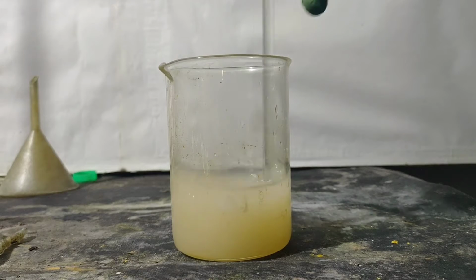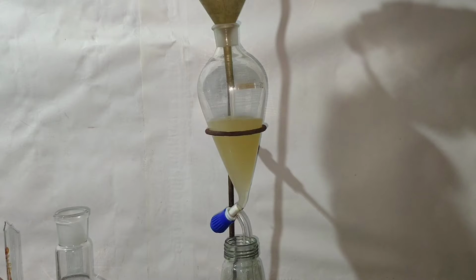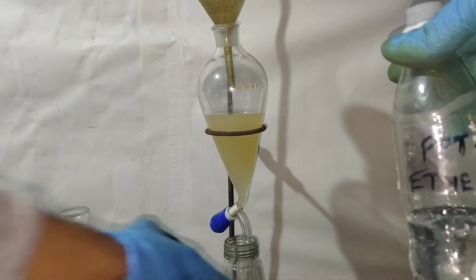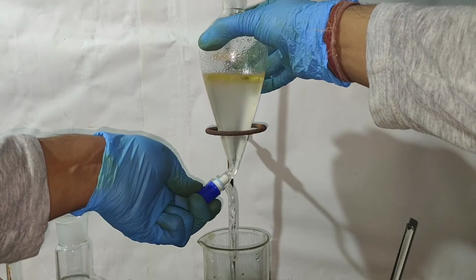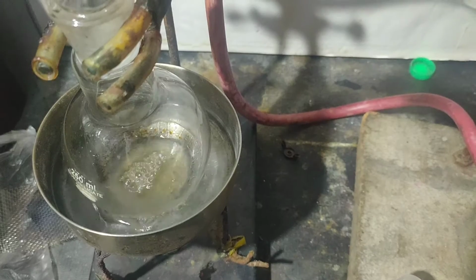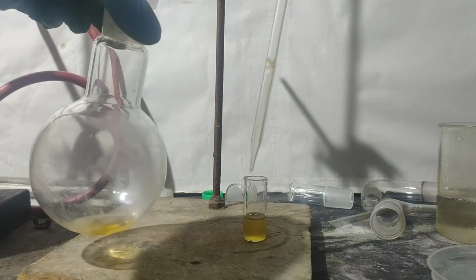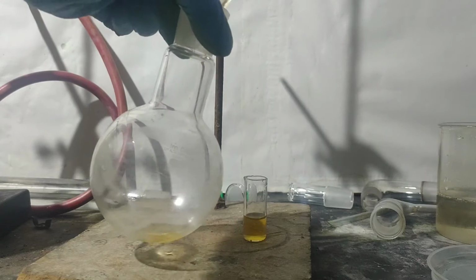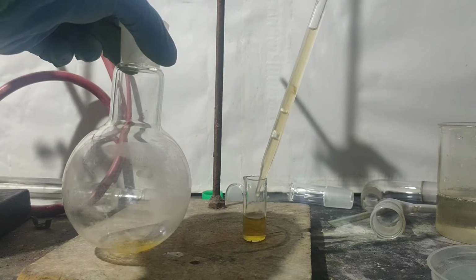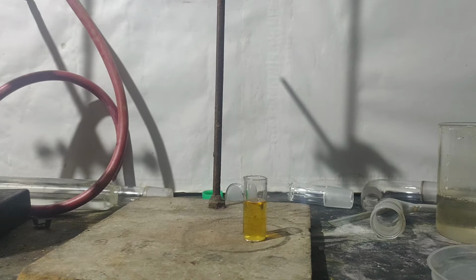I added the solution into a separatory funnel and extracted the alpha naphthylamine with petroleum ether 3 times. I distilled off the petroleum ether on a water bath and transferred the concentrate into a weighing tube. It was then left to evaporate, but the recovered naphthylamine was so little that I could not even measure it. Maybe the reaction wasn't complete, or petroleum ether was a poor choice for extracting naphthylamine. I should have used diethyl ether.